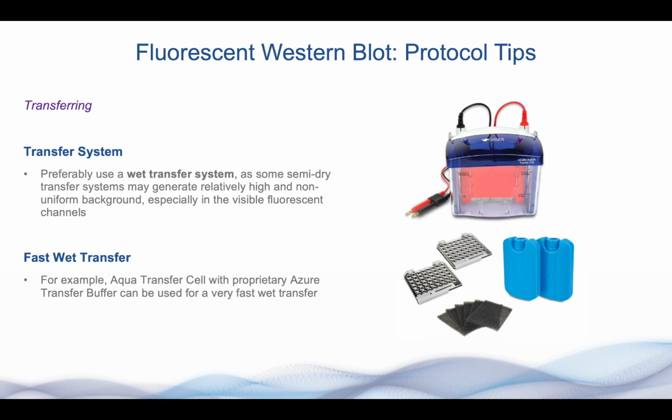Just be careful that semi-dry systems sometimes produce a lot of heat, which generally creates a high and non-uniform background. So double check this with your transfer conditions. If you need to do a fast transfer, you can opt for a wet transfer with a faster transfer buffer. For example, the Azure transfer buffer can give you transfer times down to 20 minutes in a wet tank, which is actually amazing.